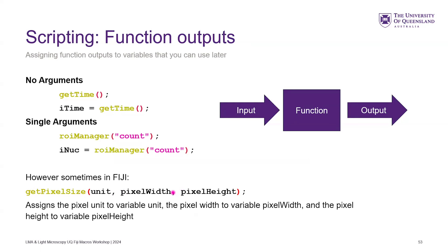Some of them use the same variable names. It assigns the pixel unit to the variable 'unit' and the pixel width, etc. But there's another one called getImageSize that also has 'w'. So just be careful with overriding of variable names.